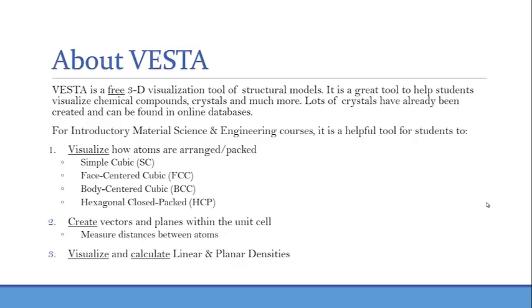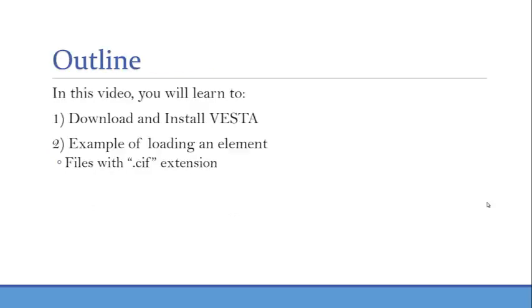Another great tool that VESTA provides is the ability to create vectors and planes within the unit cell. You can also measure between atoms and at different locations within the unit cell. I'd like to also use it as a tool for students to visualize and calculate linear and planar densities.